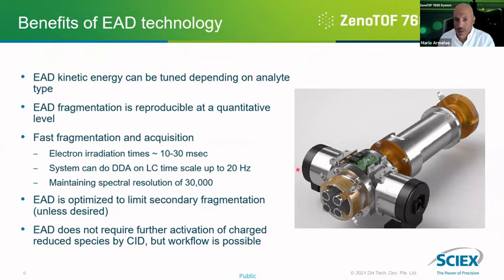So in one way, it focuses and transmits the ions, and in the other orthogonal axis, it transmits electrons. So, and already you may think, okay, so free electrons, we have an emission source on each side, and if we're getting free electrons, the only way to maintain them trapped is to have a permanent magnetic field. And that's exactly what we have here on each side. We have a 1 Tesla permanent magnet. The other thing you may think is, well, it kind of sounds like ECD. How can I use this for lipids? So just hold that thought for later on.